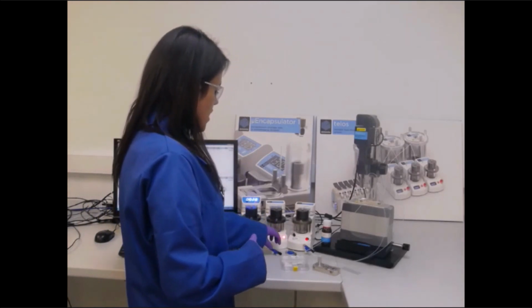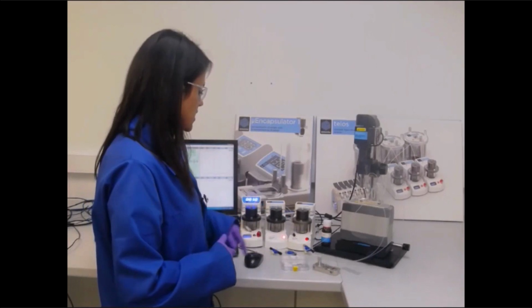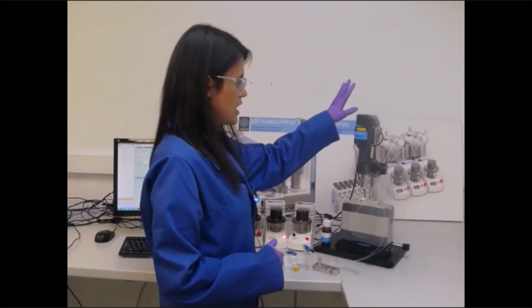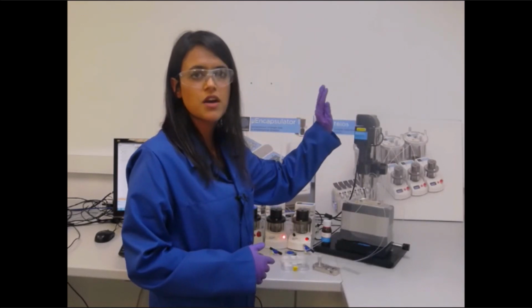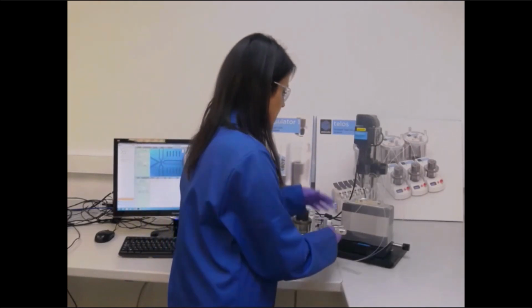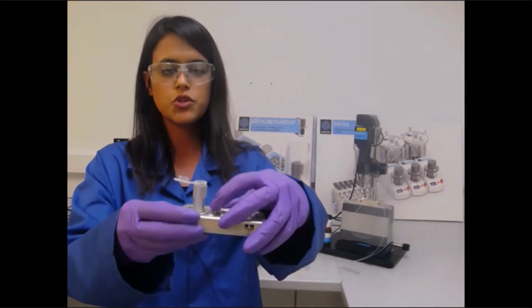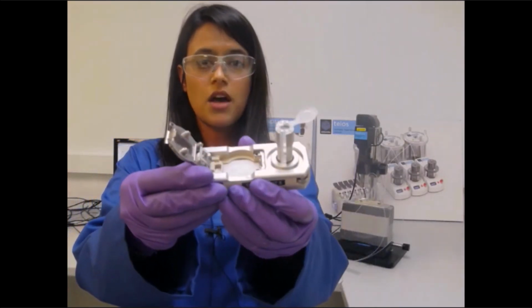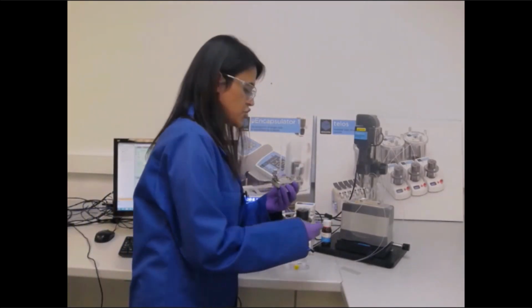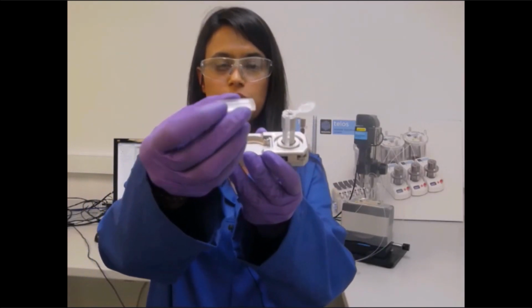So these then deliver the fluids which are placed into these containers here, and this is then connected to the TCU, and we are able to view in real time using our high-speed camera and our microscope. The way this is connected, because that's the experiment running right now, we have the microencapsulator module, which looks something like this when it's mounted on our TCU. And then, as I mentioned earlier, we've got our reservoir chip. So this is what a reservoir chip would look like.